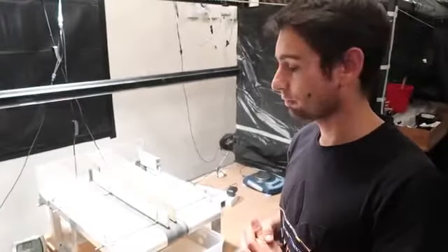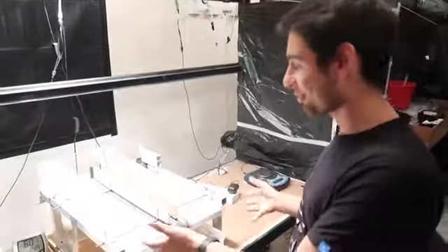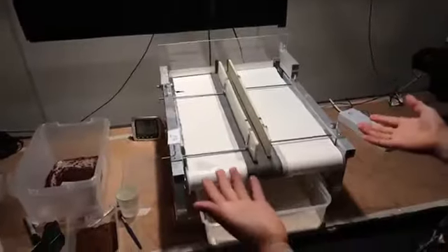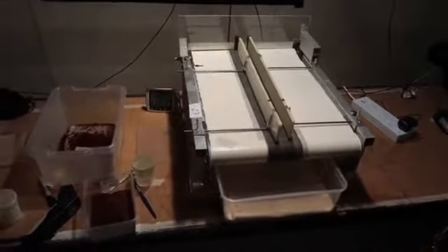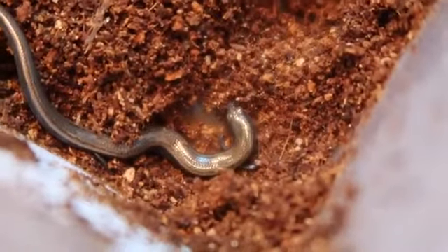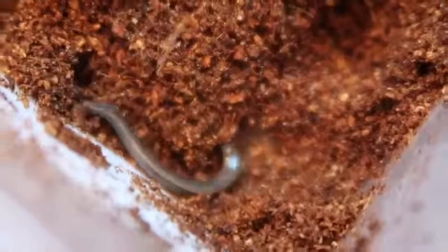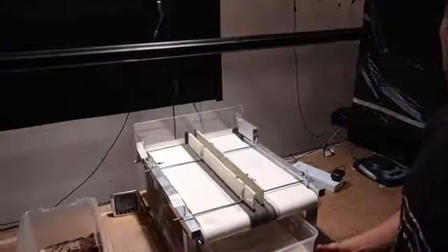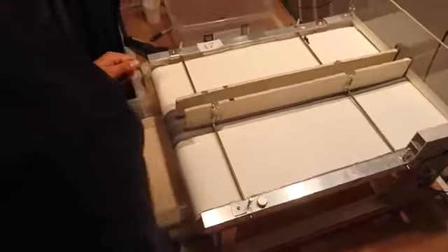we are also doing locomotor performance. We adapted this small treadmill that we got from another lab, and we were doing some work with them, and it's really nice, it looks really cool. We are not expecting a lot because, if you know the species, they are more like a snake form and their legs are very small. We have tested a lot of animals, and apparently their performance is very consistent, but as we expected, they are not very good at running. They are not taking a lot of time here. Okay, so go inside, that's it. We went until they're in the half of the treadmill, and then we start now.